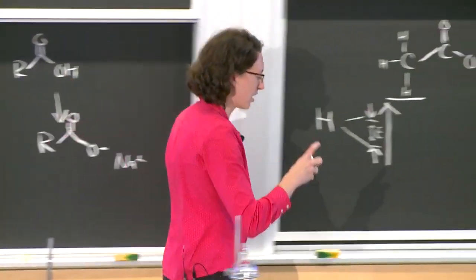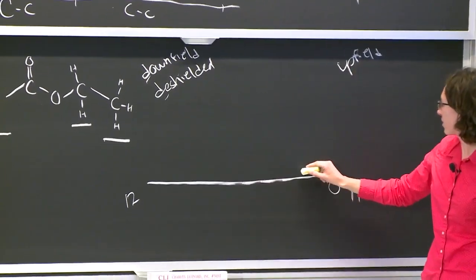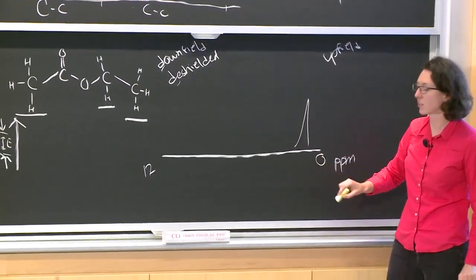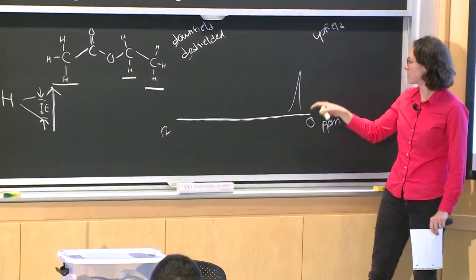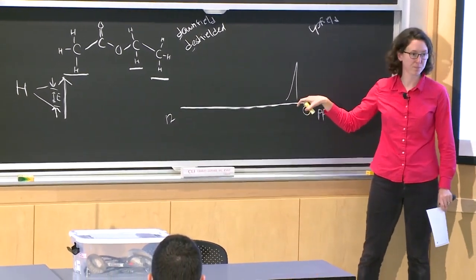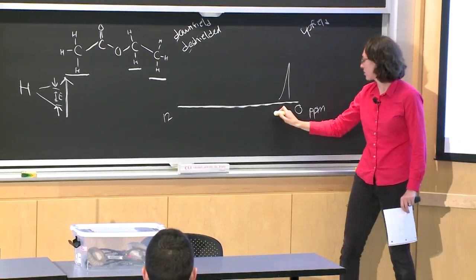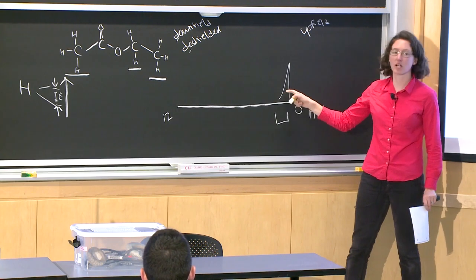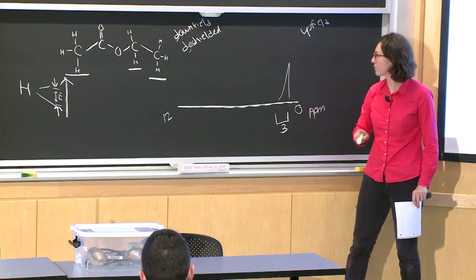So, yes. These methyl protons will be the furthest to the right, and you'll get a signal here. And so this signal, the chemical shift value, will be somewhere probably around 1 or 2. And then the integration tells you how many protons it's for, and that shows up down here at the bottom. So how many protons will this signal equal? 3 from our methyl group.